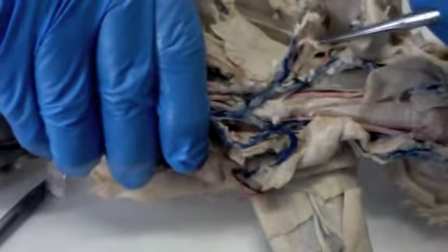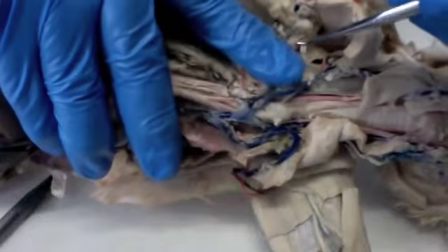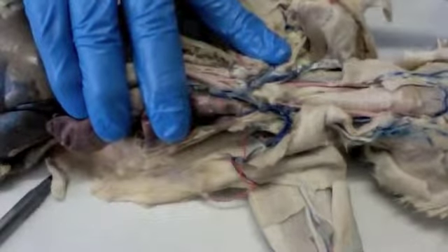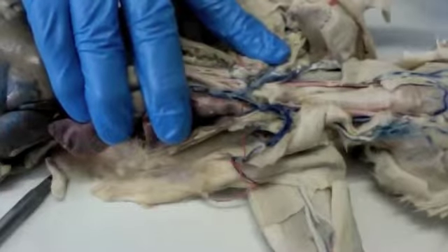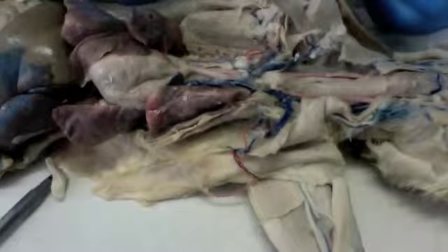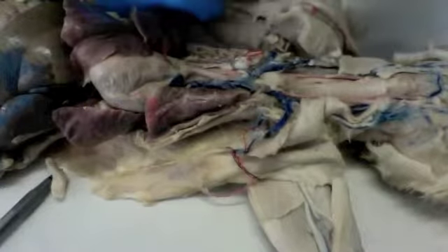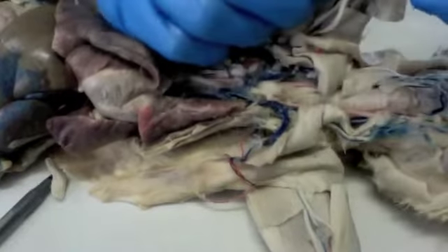So here's the axillary artery, and here's the axillary vein. The artery runs down and turns into the brachial artery, which is located here. The brachial artery then turns into the radial artery, which is located in the elbow pit of the cat, located here. And then below that we have the ulnar artery, which is located here.